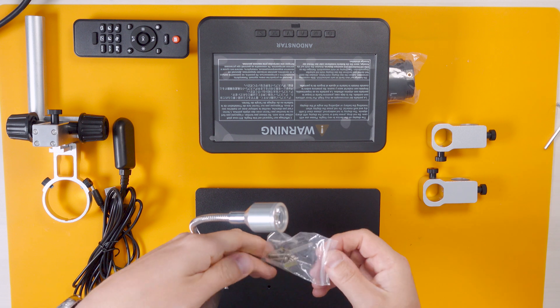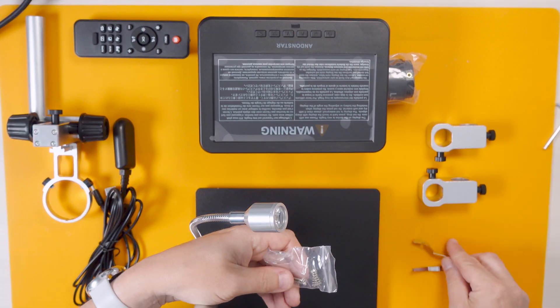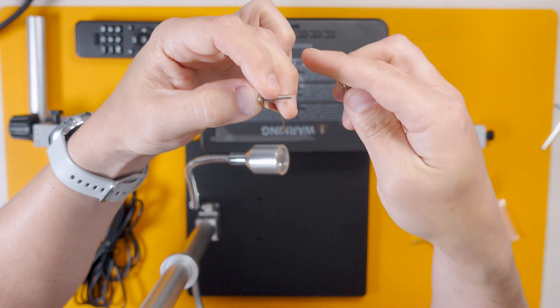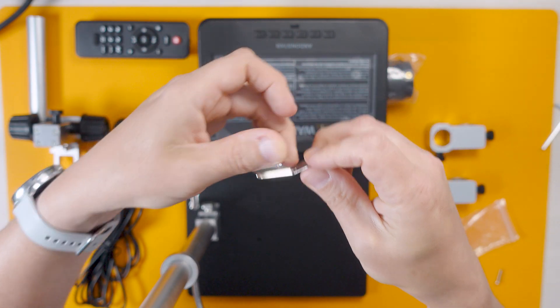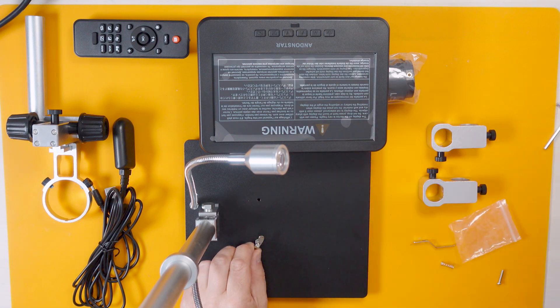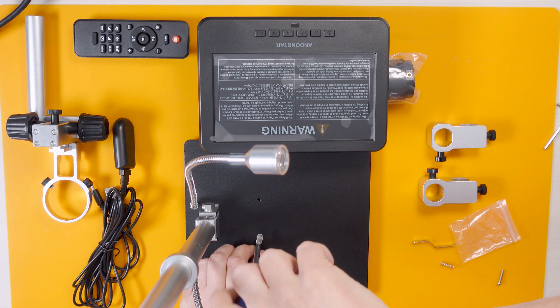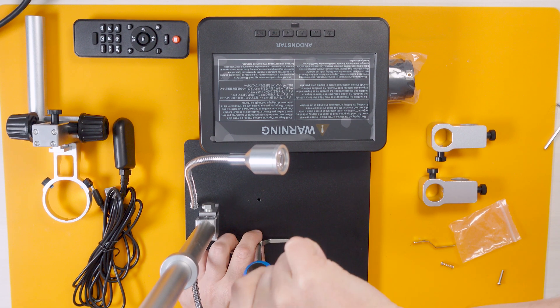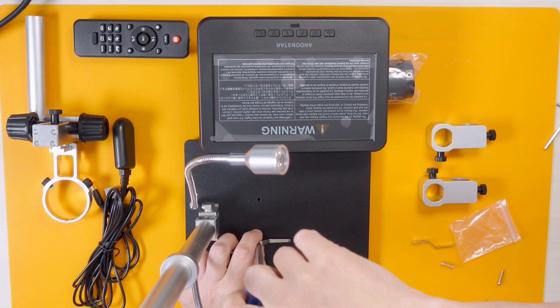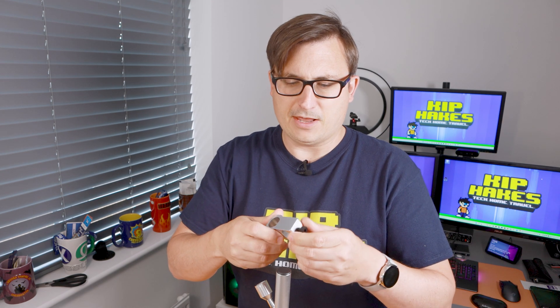Before I install too much more, I'm going to screw these little clampy guys on. You put the screw through, put the spring on, and then you screw into the base. This is where I don't have a screwdriver the right size — but I do, thank the Lord. So this is where we came unstuck last time. Hopefully that won't happen this time.